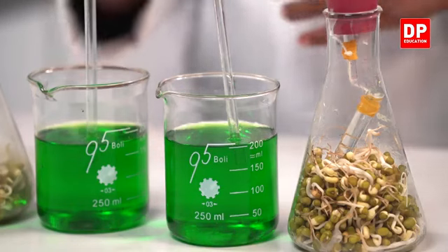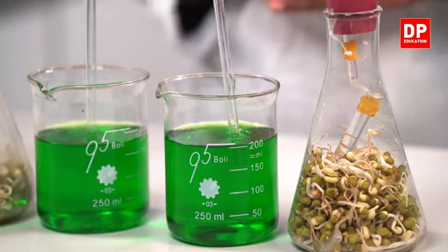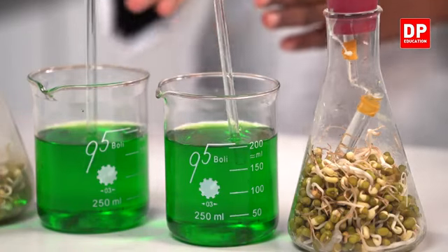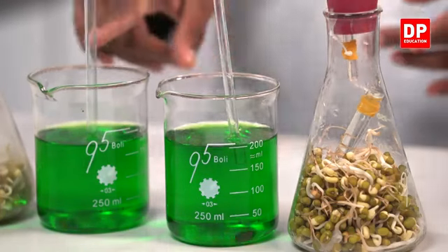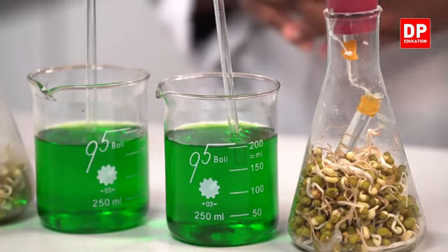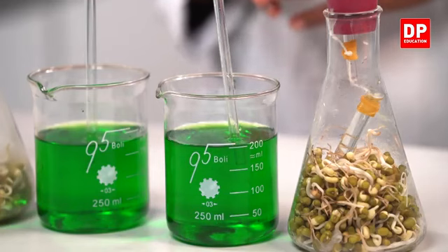Here also you will see a slight rise, but it will not rise any further. That is due to the nature of water. It rises up a little bit into the glass tube. In both, now you can see the water levels inside the glass tubes are almost the same. Observe the setup carefully.